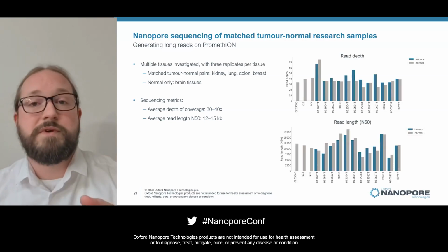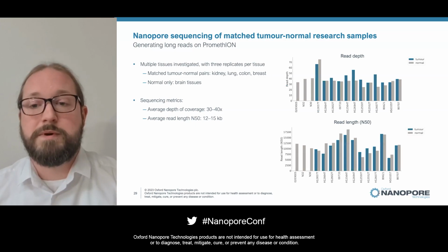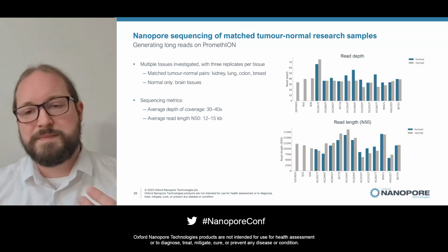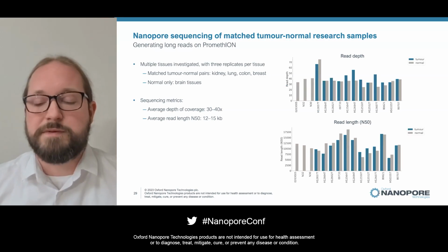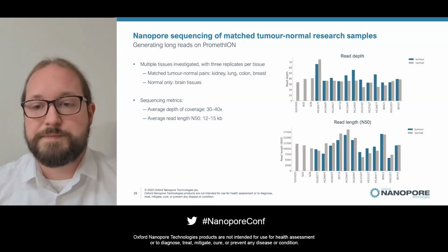Here's an overview of read length and depth per sample. As you can see, the read length changes a bit. Again, it depends on the fragmentation of these samples, and these were quite different samples and tissues in a sense, so this makes sense.